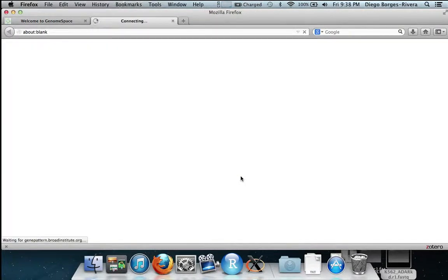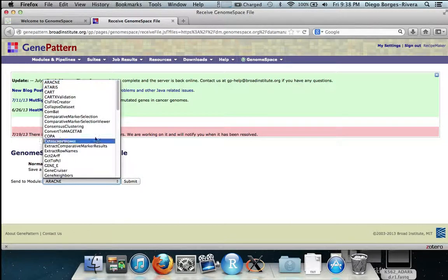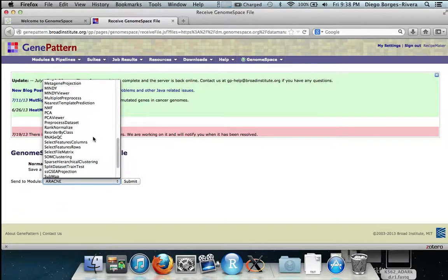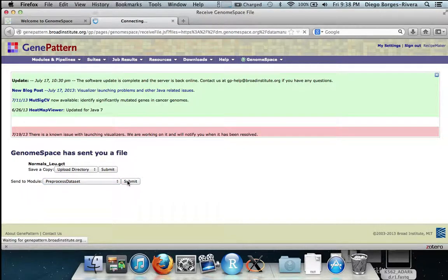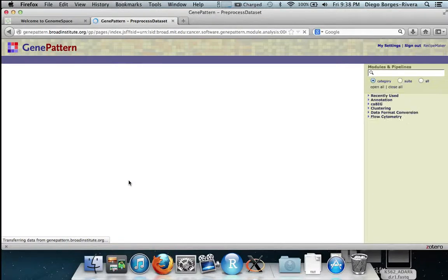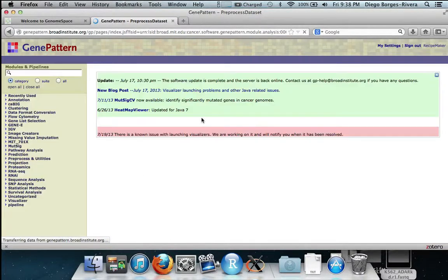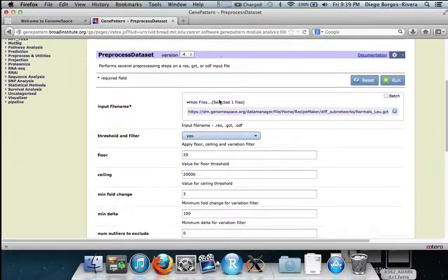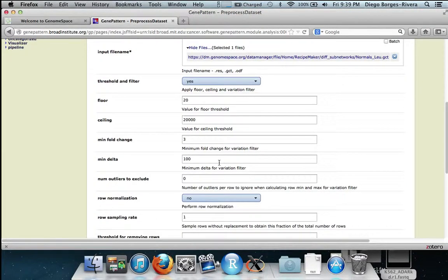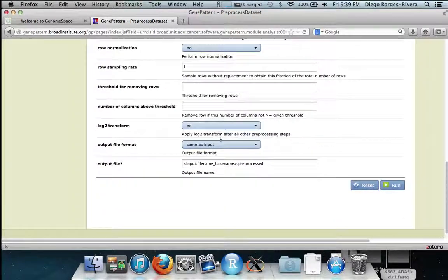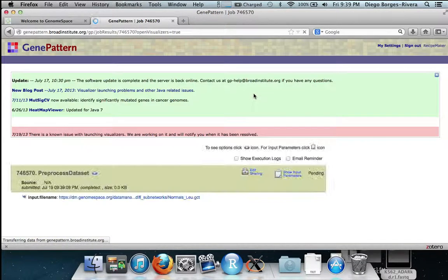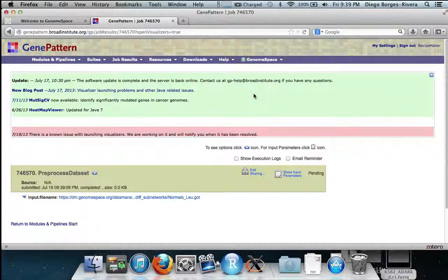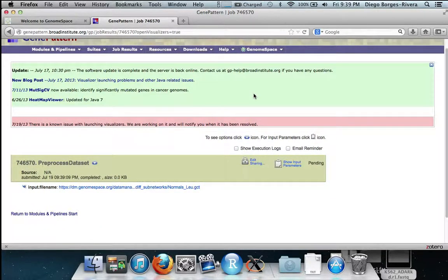We now want to select the genes that have at least a three-fold expression variation. We do this by sending the GCT expression file to pre-processed data set by selecting it from the drop-down menu and hitting select. In pre-processed data set we set the min fold change to three and then hit run. This will produce a filtered GCT file containing the genes which pass the threshold.